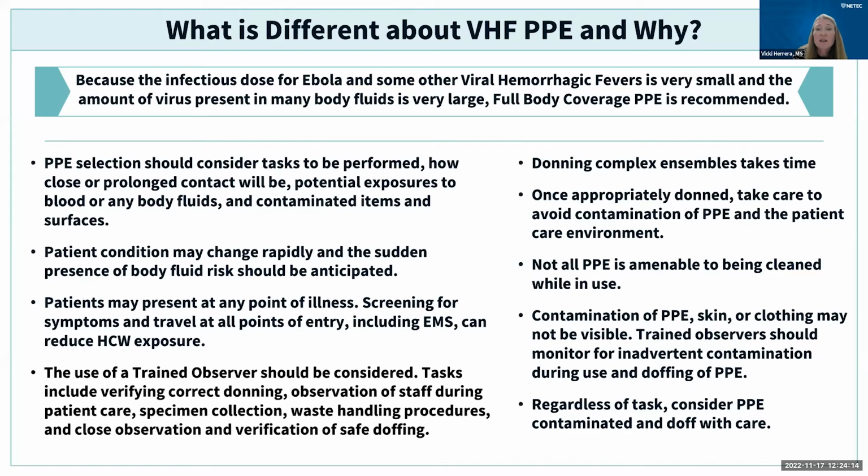Keep in mind that donning complex ensembles takes time. So you need to plan for that time. Once you're appropriately donned, take care to avoid contamination of the PPE and the patient care environment if you're in the room. Not all PPE is amenable to being cleaned while it's in use, so keep that in mind. And contamination on the PPE, skin, or clothing may not be visible.